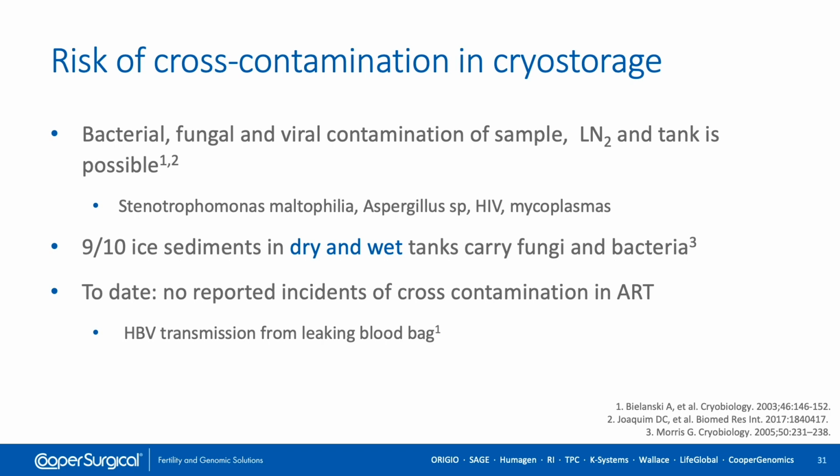Over the long term, ice sediment accumulates within storage dewars and poses a contamination risk to stored human samples. Ice forms within liquid nitrogen via two general processes. It forms in the atmosphere above an open dewar and falls into the vessel, or it forms upon cold surfaces of the dewar during inventory of stored material. Ice crystals aggregate and entrap other materials, such as bacteria, fungal spores, and general lab debris present within the liquid nitrogen.